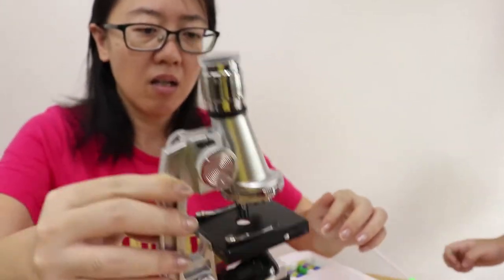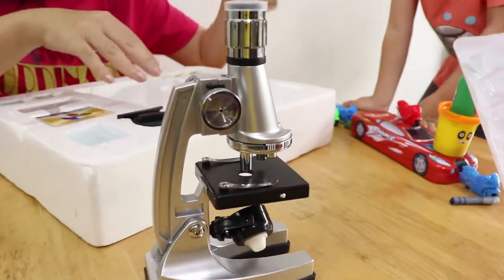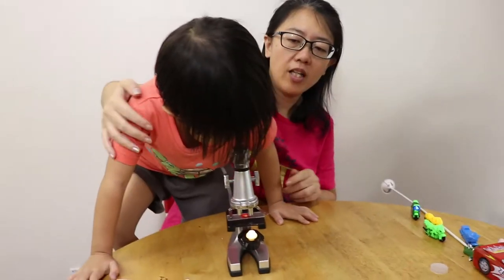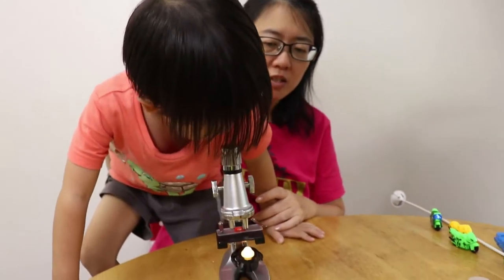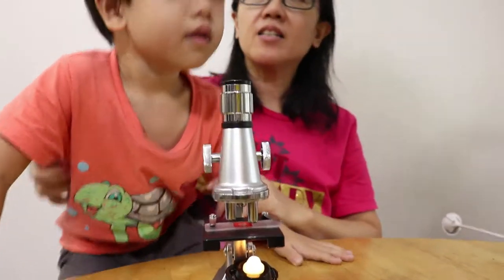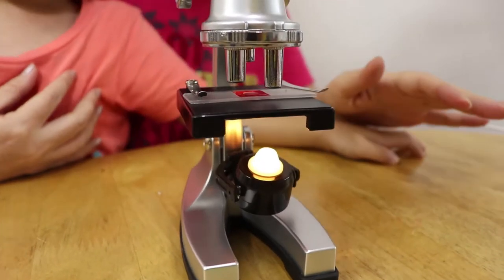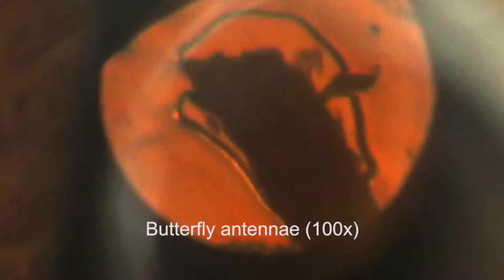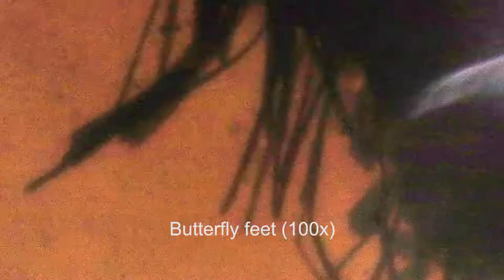It's very light. I think this is a portable one. It's portable and light so that you can take it out on nature walks and things like that. So we have been experimenting and learning to use this for the past few hours. This is a bit like the microscope I used when I was in school — this is like the toy version of it.